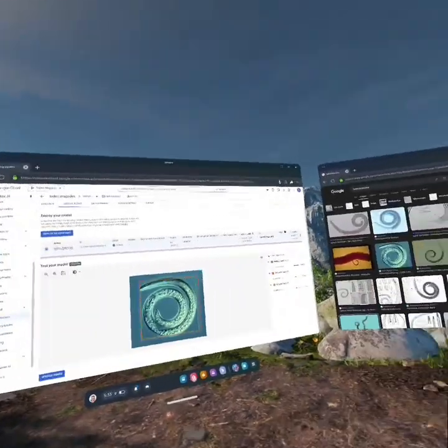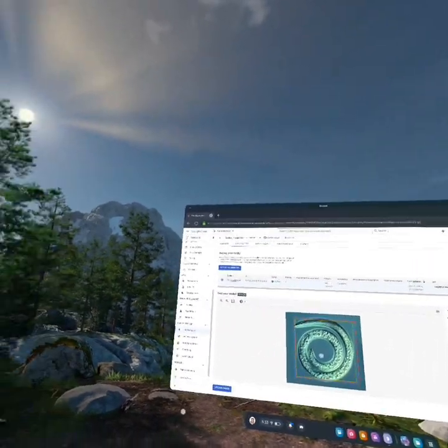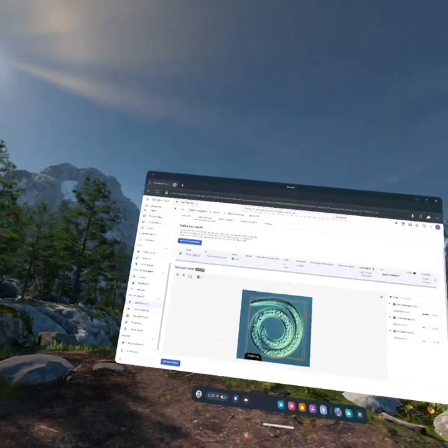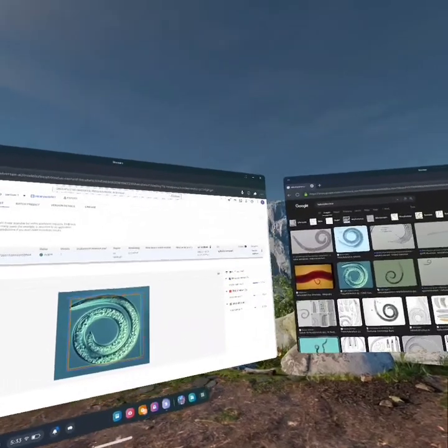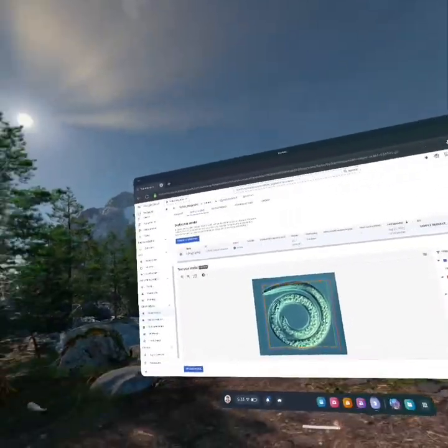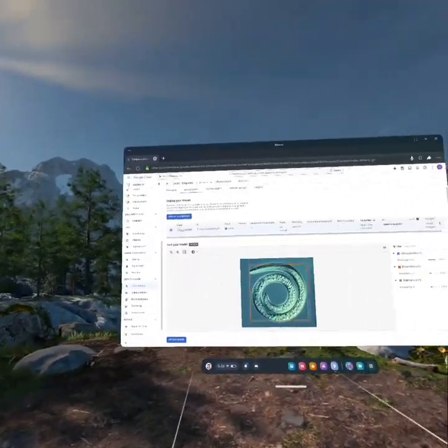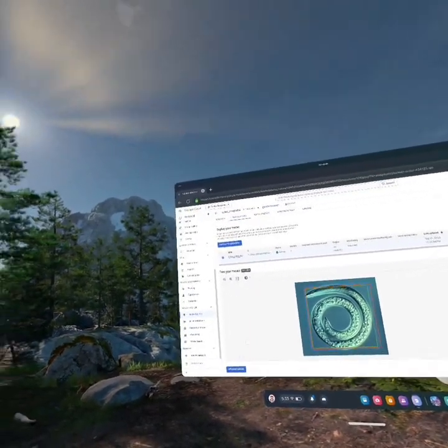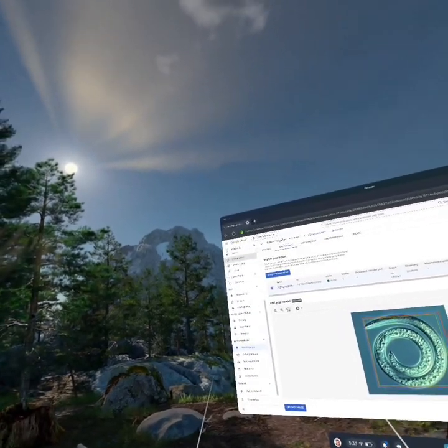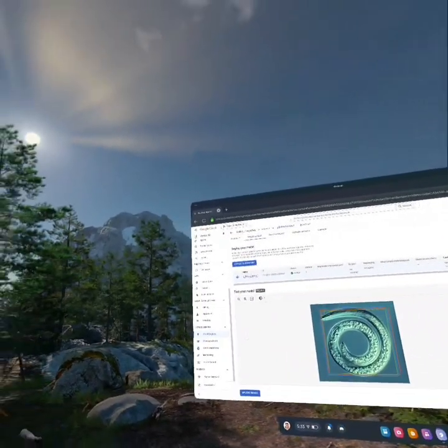But today I just really wanted to give you guys a quick demonstration of what artificial intelligence and machine learning is capable of. I don't know if I've already mentioned, but I've had practically no experience before doing all this. So this has pretty much been me learning on YouTube and using ChatGPT or Gemini, thanks to Google. So I've been trying to honestly keep it all within the Google platform just for ease.